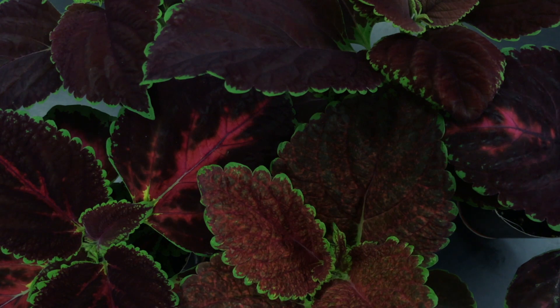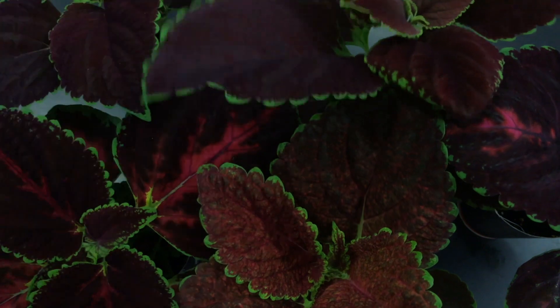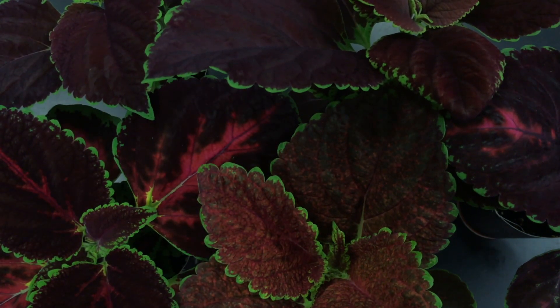In this transpiration lab, we're going to measure the rate of water loss by these plants through their stomata on the undersides of the leaves. There are little pores by which water transpires, and evaporation through those pores pulls water by bulk flow from the roots all the way to the leaves. We're going to measure this rate of transpiration by measuring the water loss or loss of mass over time by putting these plants into different environmental conditions.